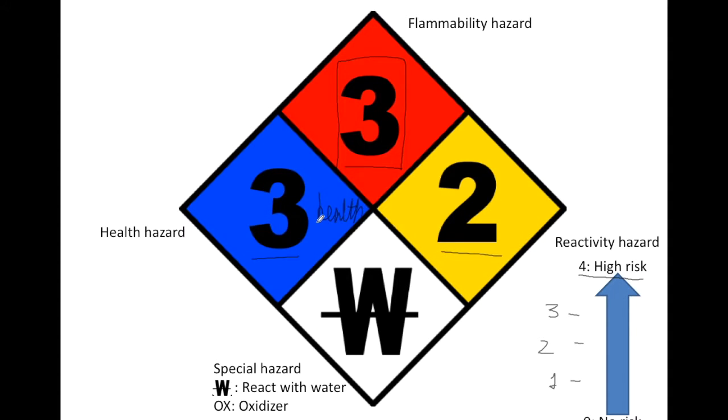For every chemical, this NFPA diamond is different. I'm not sure which element this is for, but apparently there's a okayish high rate for you to get sick when exposed to this, because blue is the health hazard and 3 is the level.